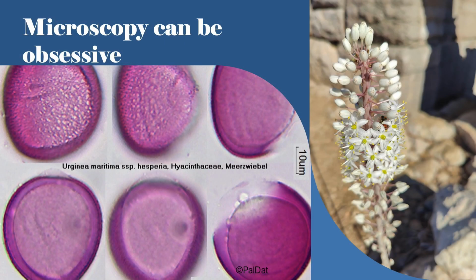What we have to do as beekeepers, if we're going to try and understand what's within our honey, is start to build up a library of what pollens are out there so that we can match them back into our honey. And it just becomes obsessive.